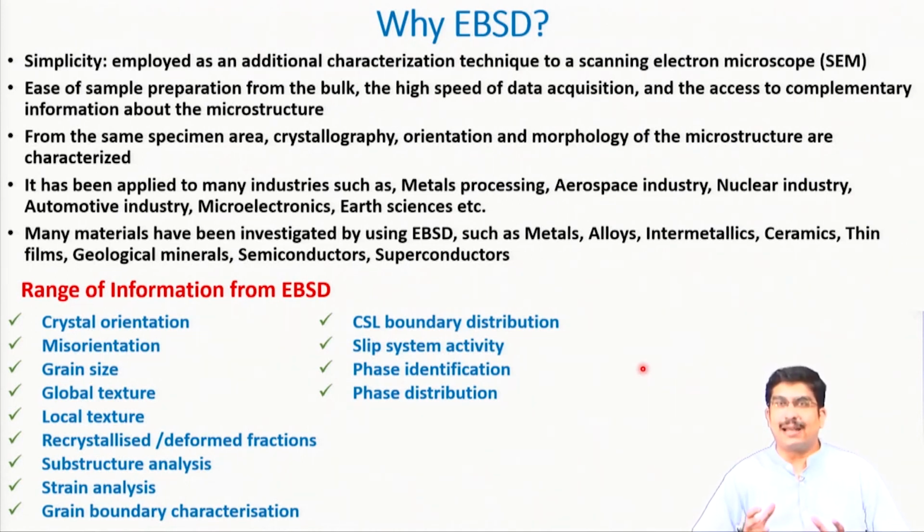It can be fitted in a scanning electron microscope. Most often that is how you see it, though a similar technique can also be used in transmission mode, but today we will mostly discuss EBSD as used in a scanning electron microscope. It comes as an additional detector, and with almost every scanning electron microscope you procure these days, with a little extra money, you can also get electron backscatter diffraction.